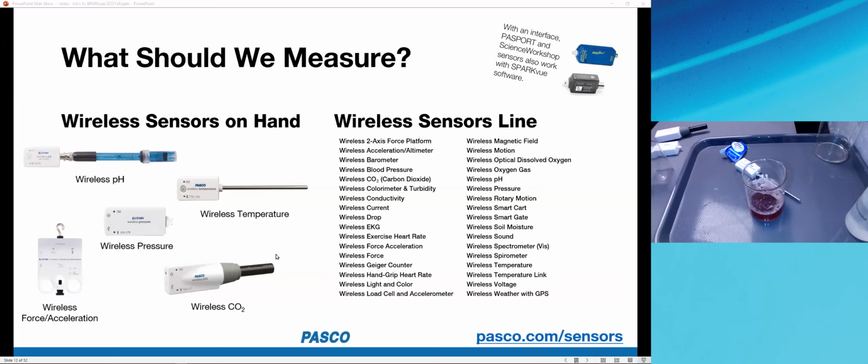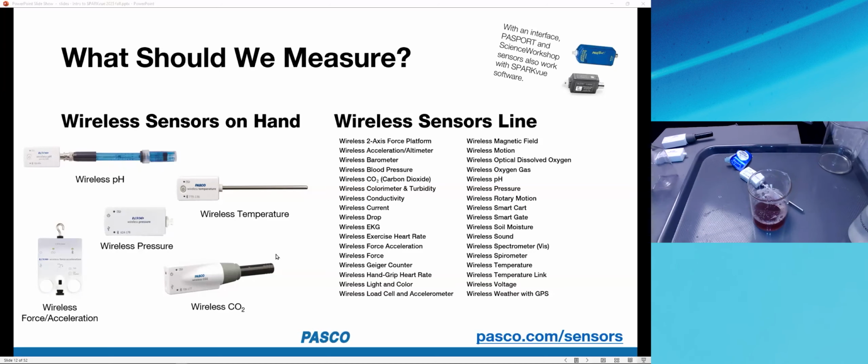All right. If you need to change the relative size of the live video and the screen, there should be a handle that allows you to do that. All right, Barbara has another suggestion there.